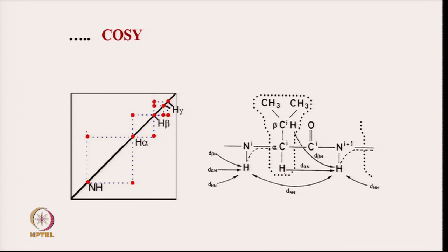What is useful is cross peaks, because that tells you which proton is talking to which next proton. So, here are the 5 cross peaks, because there are 5 different atoms. So, this is one, this is the second, and this is the third, and then your gamma, the fourth one.